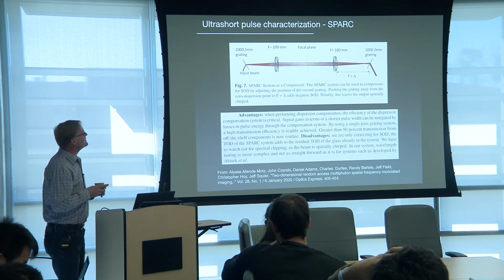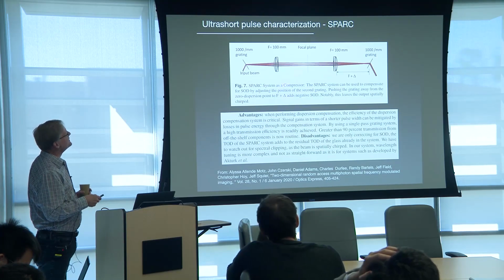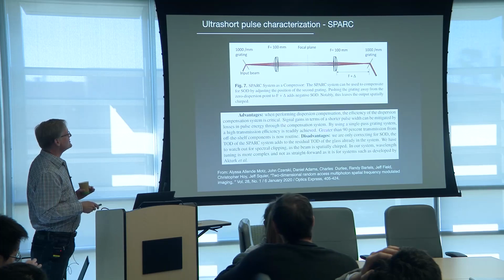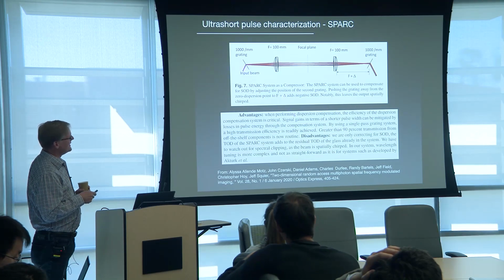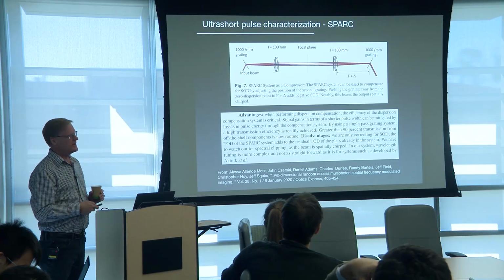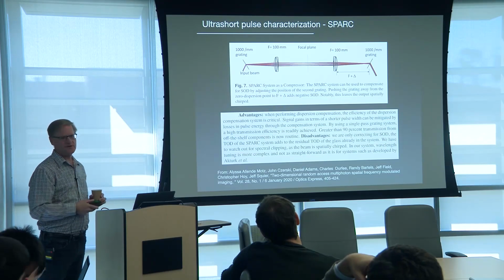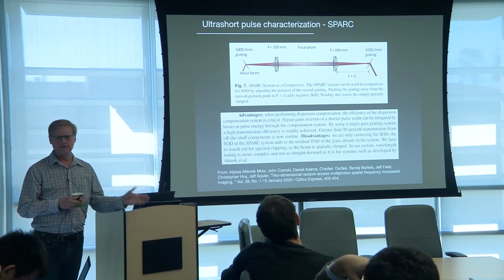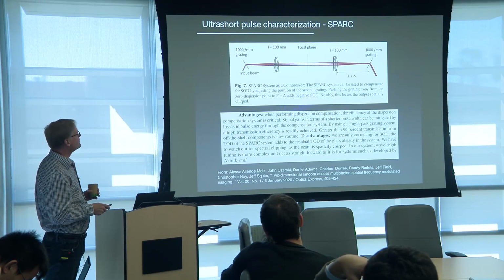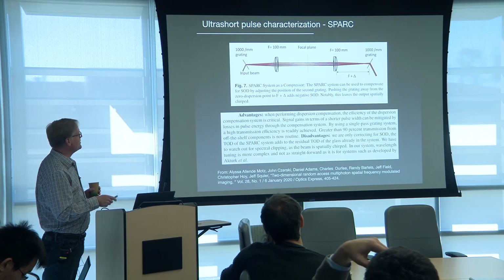And so here I've summarized. This is what it looks like. There's an actual Zemax ray tracing of the system. The advantage, especially in terms of transmission, is that with these gratings these days, you're going to get greater than 90% throughput through the system. So your pulse compensation system is barely going to attenuate your beam. So that's great. And now you can measure your pulse.